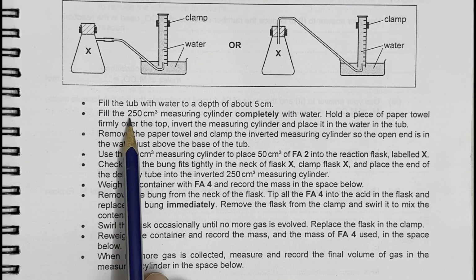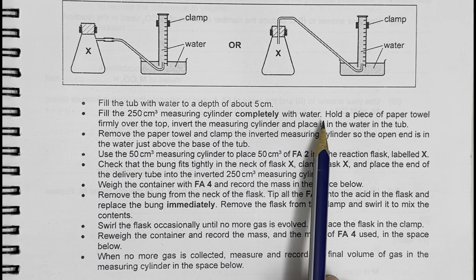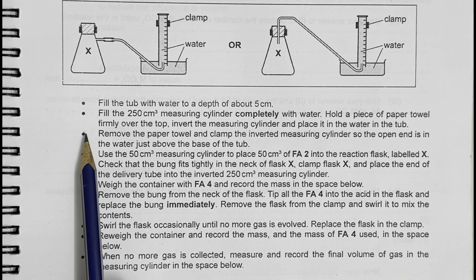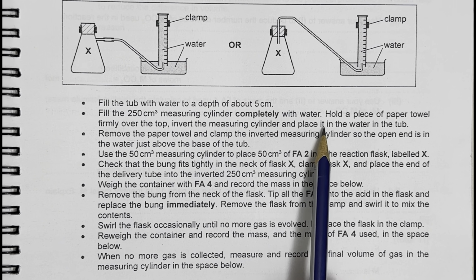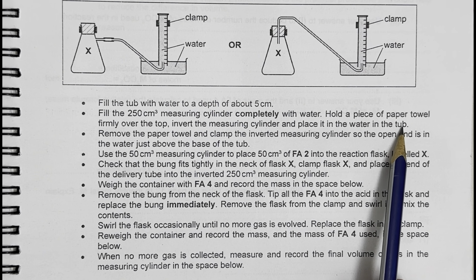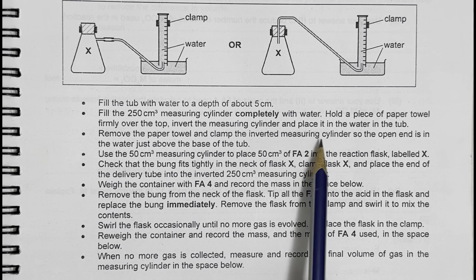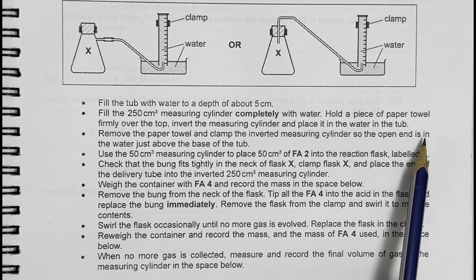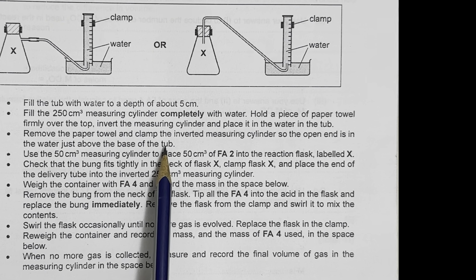Now fill the 250 centimeter cube measuring cylinder completely with water. Hold a piece of paper towel firmly over the top. Invert the measuring cylinder and place it in the water in the tub. Remove the paper towel and clamp the inverted measuring cylinder so the open end is in the water just above the base of the tub.